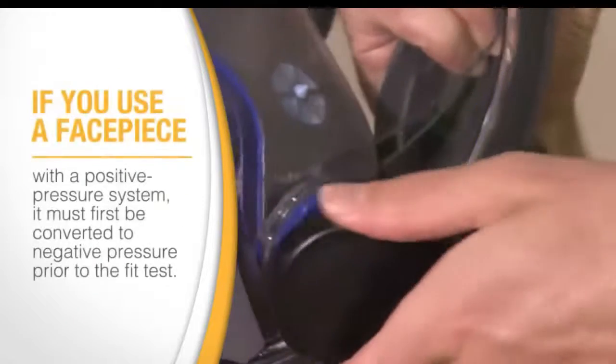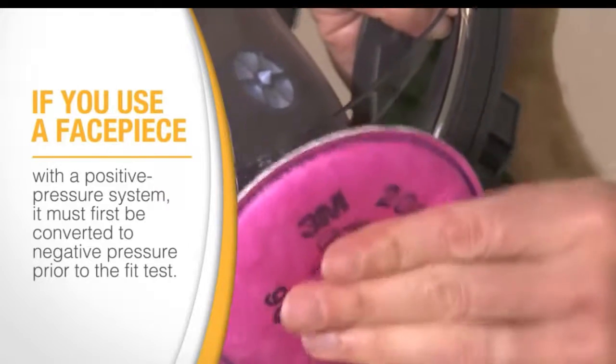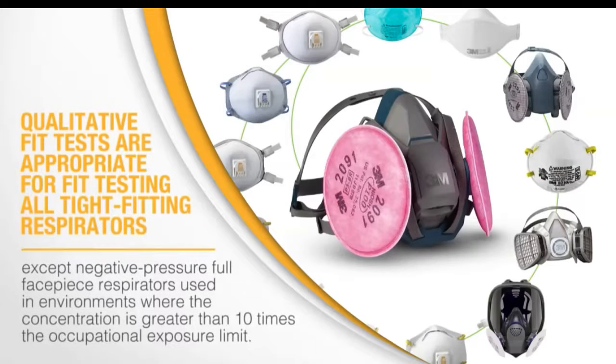If you use a facepiece with a positive pressure system, it must first be converted to negative pressure prior to fit test. Qualitative fit tests are appropriate for fit testing all tight-fitting respirators except negative pressure full facepiece respirators used in environments where the concentration is greater than 10 times the occupational exposure limit.